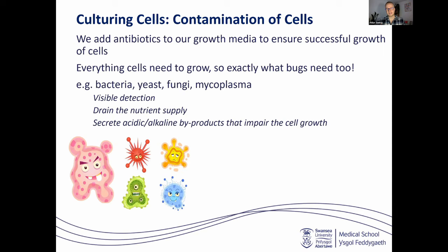But what is an issue is that they kind of gobble up all of the food and the gases that the cells on the dish need, so ultimately kill them off and can completely change the growth environment for those cells. So we can't use them. They need to be thrown away, and the incubator and everything needs to be cleaned down to try and reduce the risk of any other cells becoming contaminated.